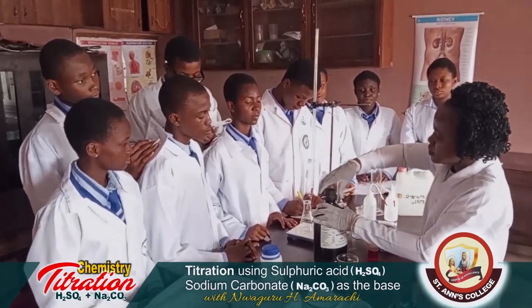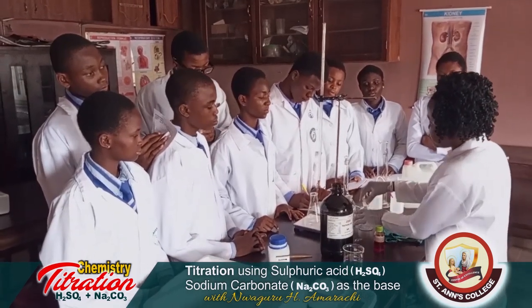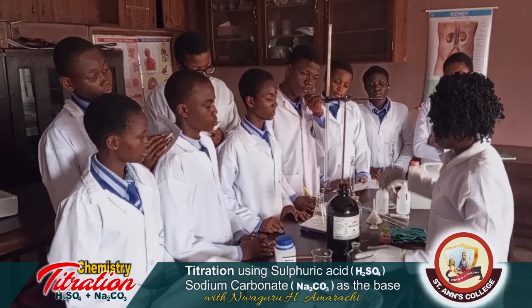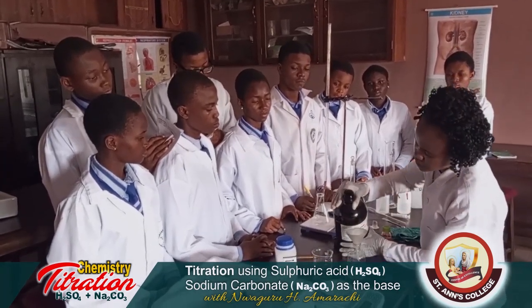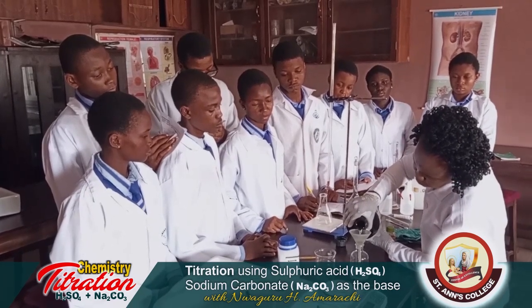This is a stock bottle. We need to fetch a little quantity of this acid to a reagent bottle.